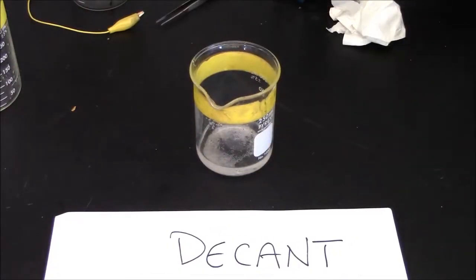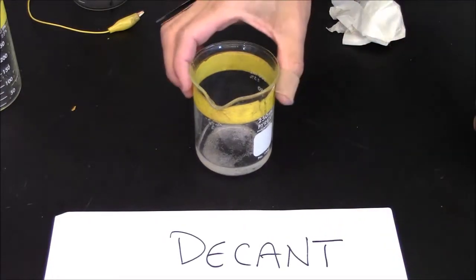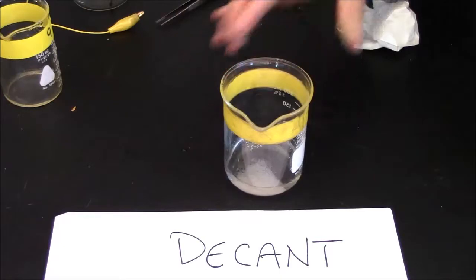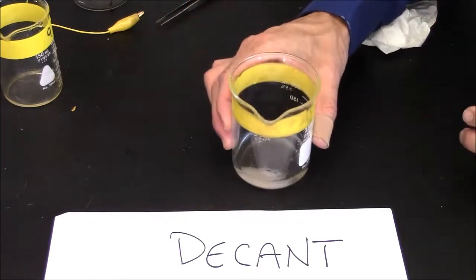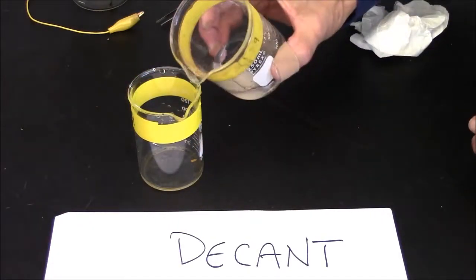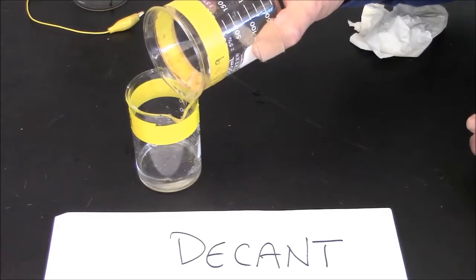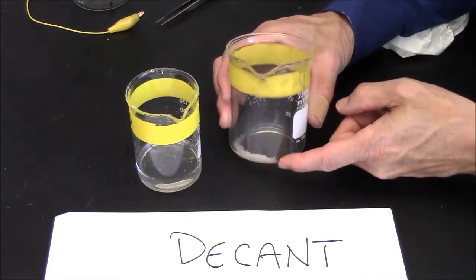In step 10 of your instructions, it asks you to decant. So decanting is a way of separating solids from liquid. Here I have some sand, beach sand, in water, and if I were to just swirl this up and dump it, everything would come out together. But if I use a little bit of care, I can pour off the liquid while keeping the solids, the sand, still in this beaker.